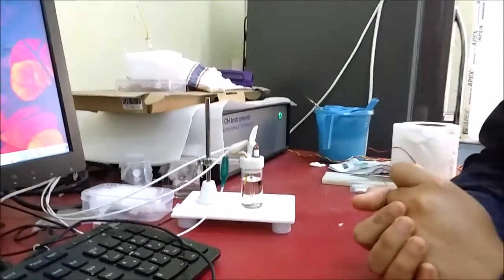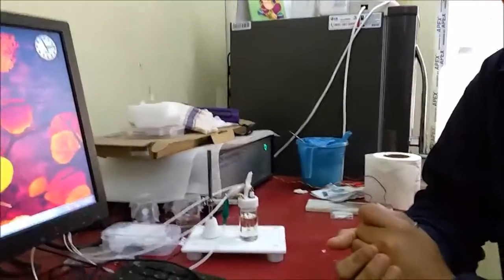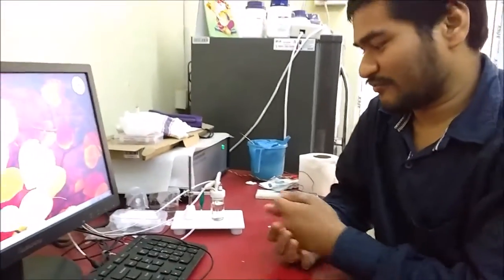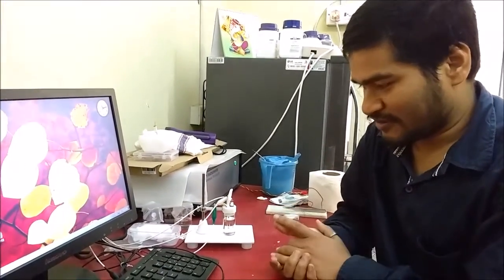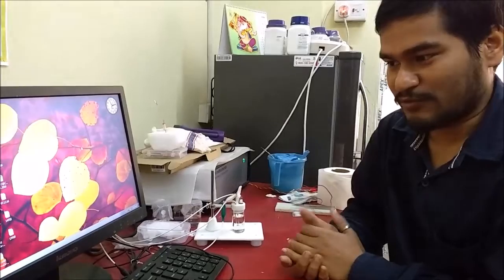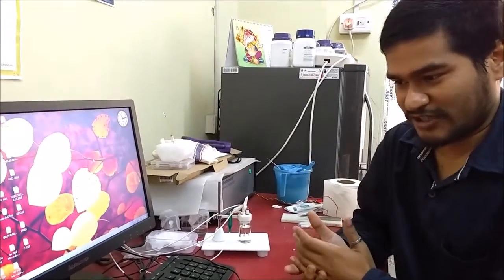I have dipped my working electrode a few minutes ago and you have to do this also. You have to give it some time so that some adsorption or surface adsorption can happen.